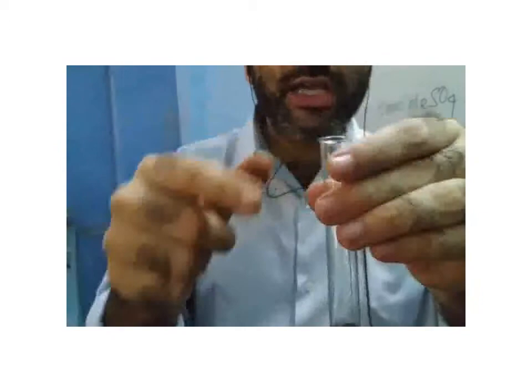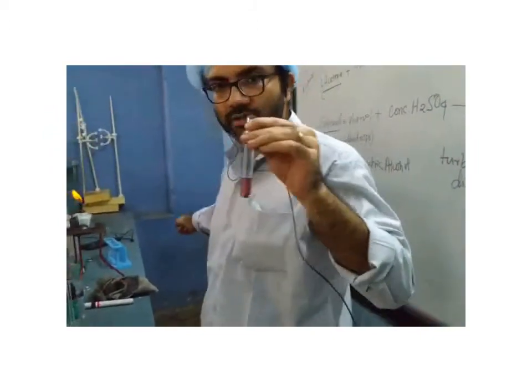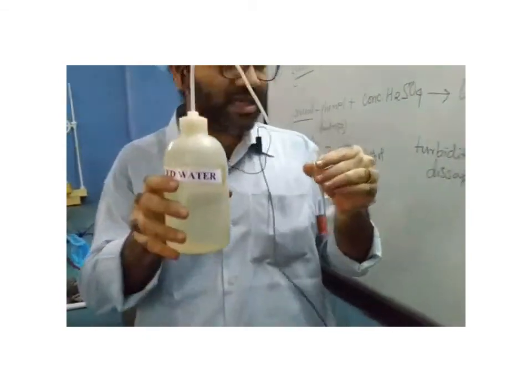Now we need to add water, that means we need to dilute the solution. If we dilute the solution, what will be your observation? I'm going to add water to this. I'm going to dilute the solution.